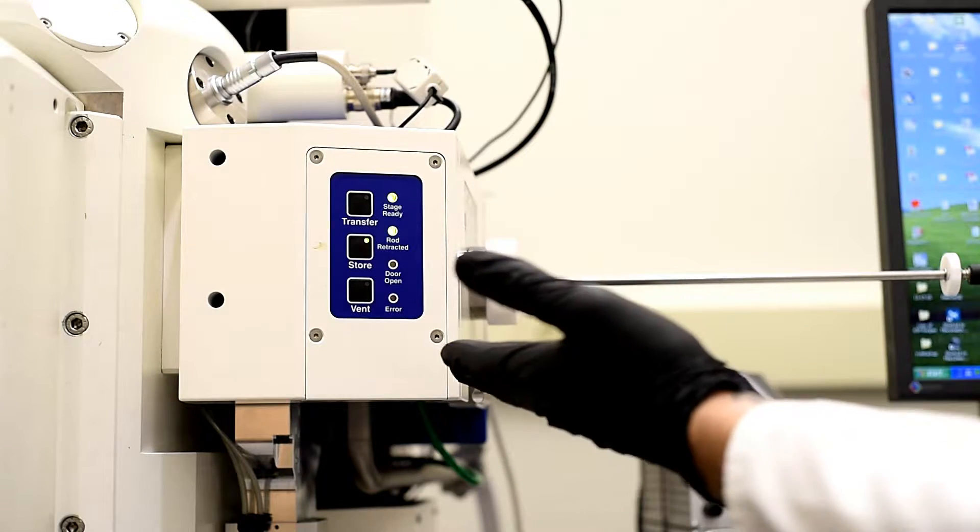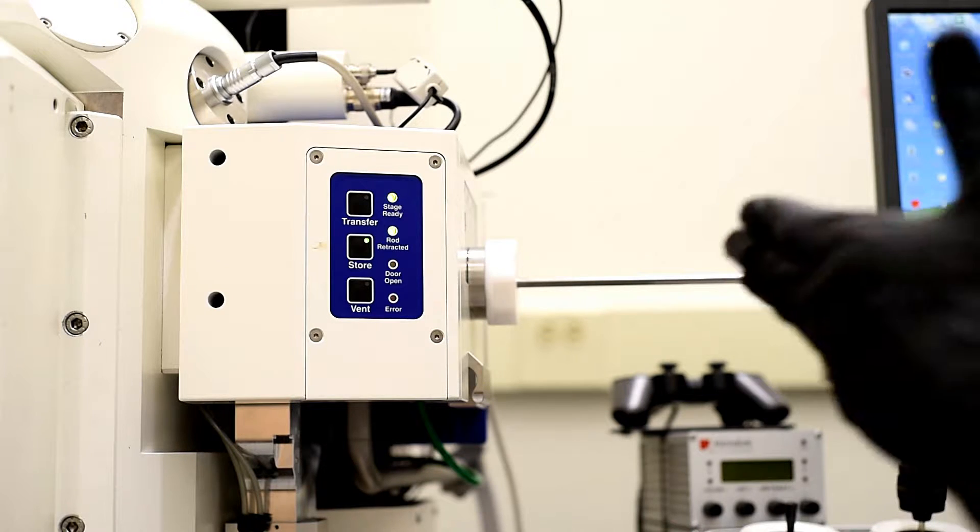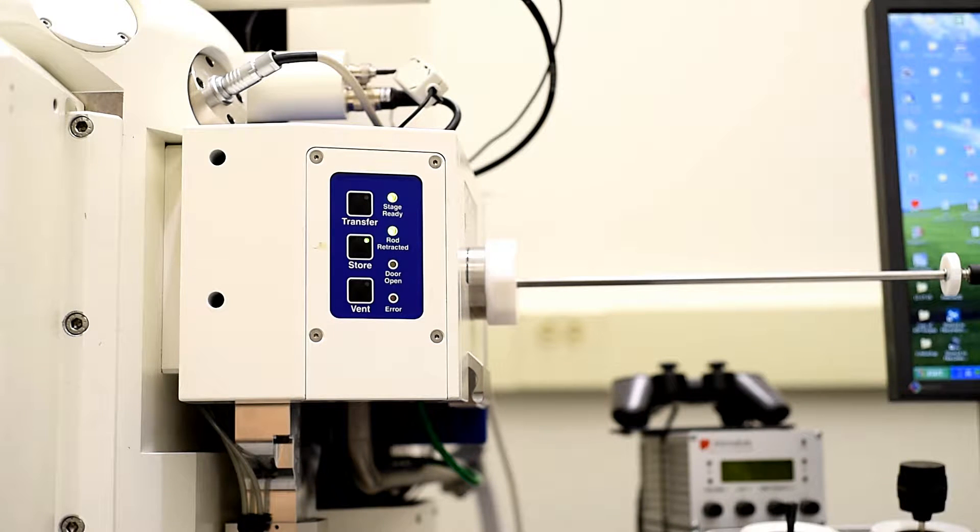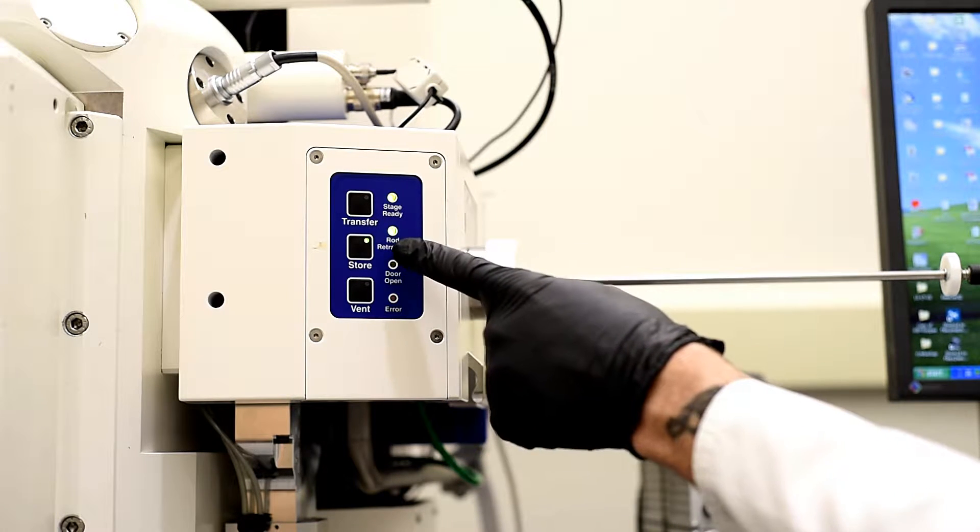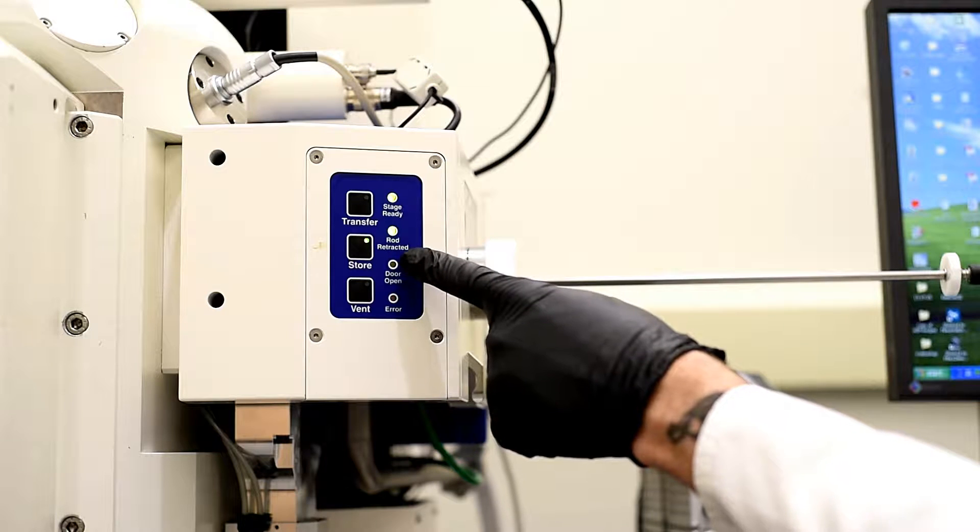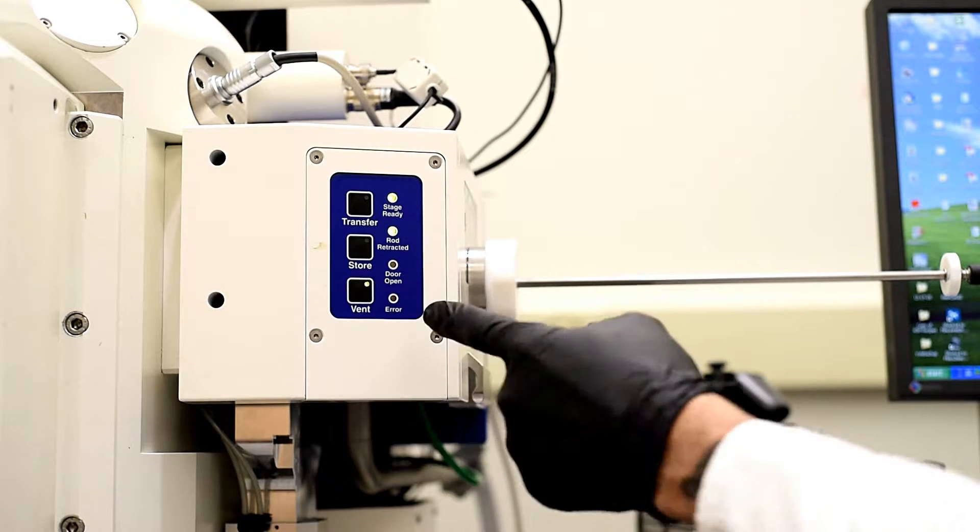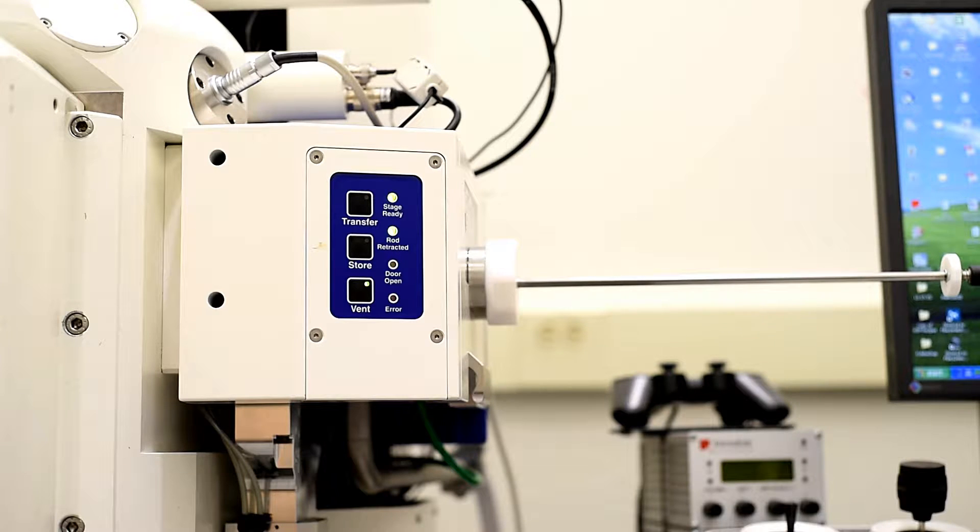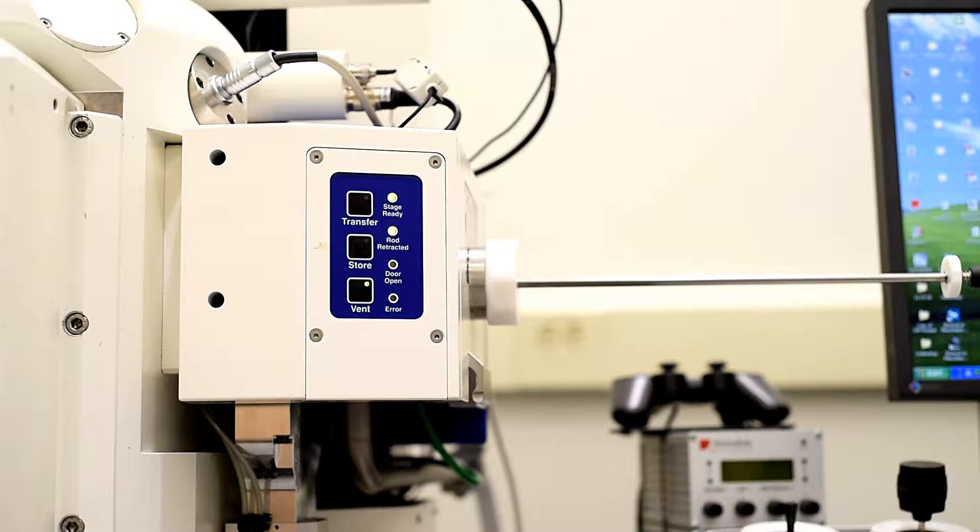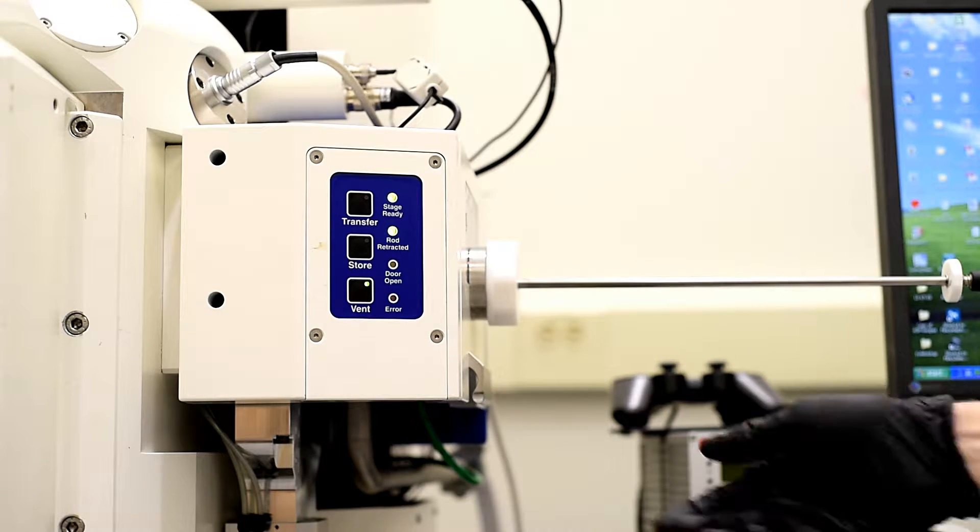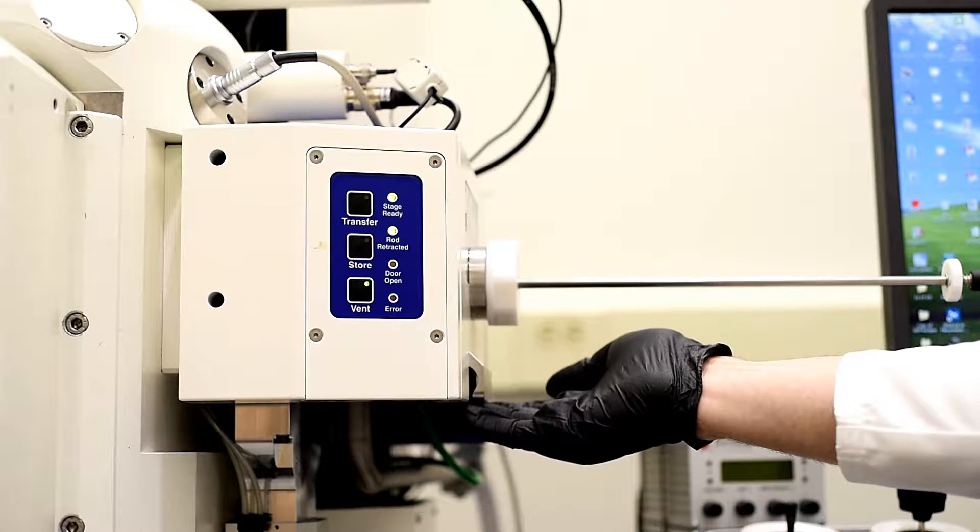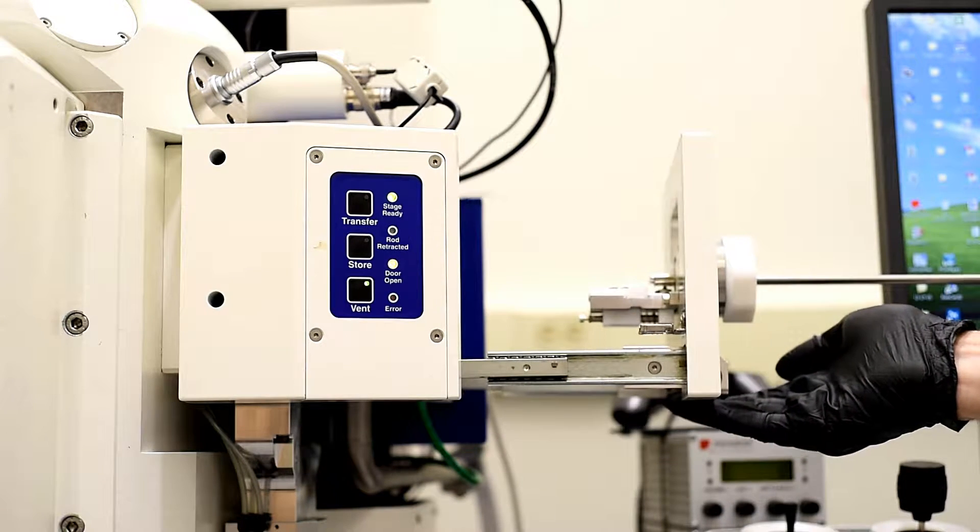This is the airlock. That's how we get our sample in and out of the SEM. So you'll see that it's in the store mode. So what we'll do first is hit vent. And the light will blink green. Once that stops blinking, we can actually open the airlock door. So it's solid green. We can pull this lever to open the door.